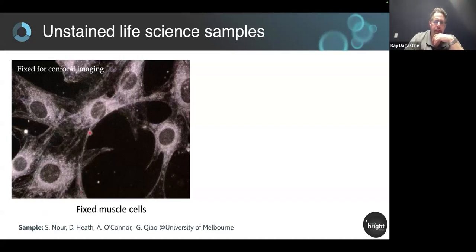You can see where the membrane is. You can see cytoskeleton as well. You can even see things in the nuclei. And it's different in that you're actually seeing the whole cell as it is in nature, not just the parts that you might tag in fluorescence.